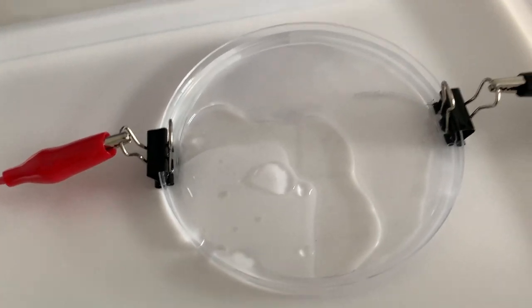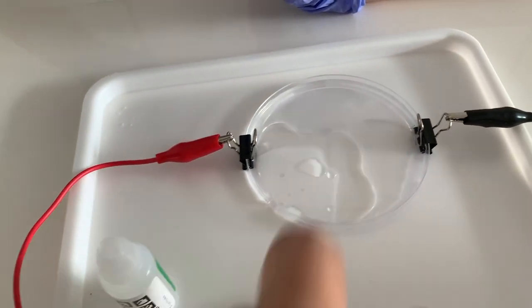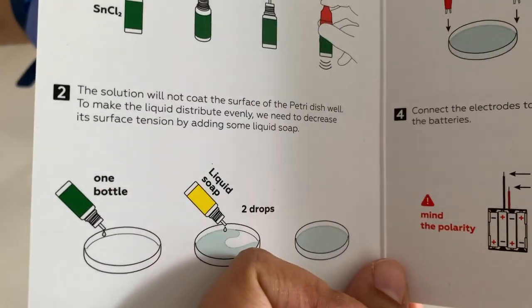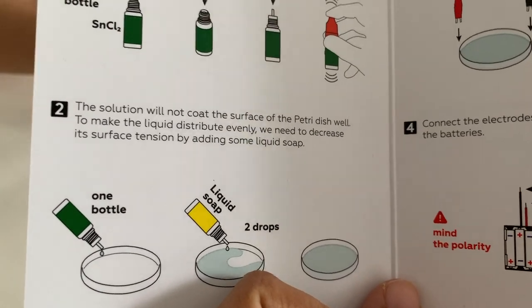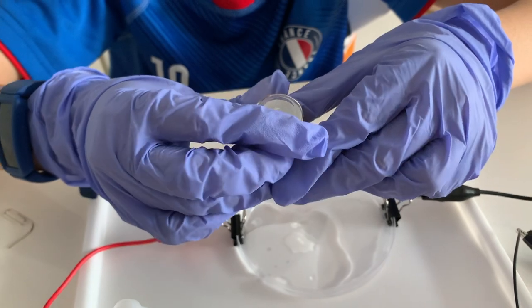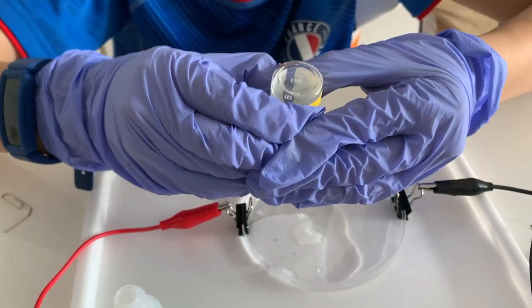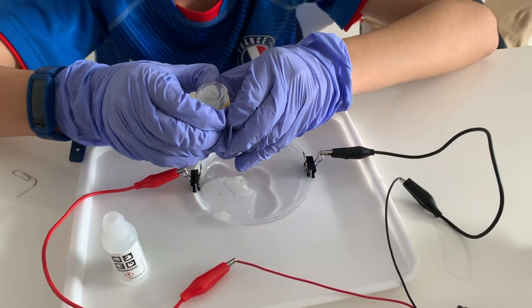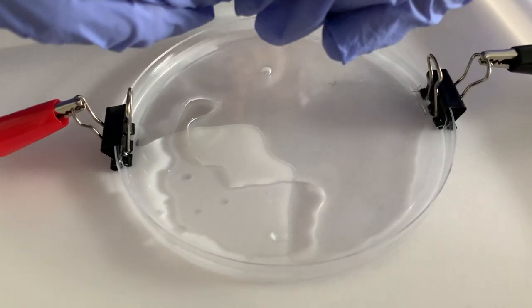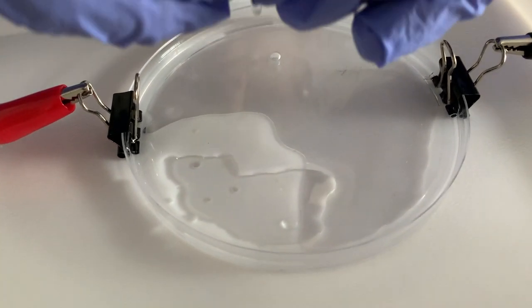We observe that the liquid is not enough to cover the dish. There is an instruction booklet which says we are supposed to pour some liquid soap to decrease the surface tension. This was not mentioned in the original instructions. Let's see what's happening now.